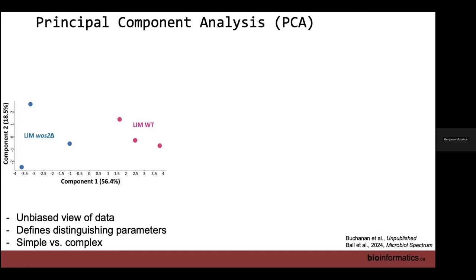Yeah. So as far as I know, PCA is a kind of linear dimensionality reduction, whereas there are a bunch of tools which do non-linear dimensionality reduction. Benjamin also mentioned t-SNE, UMAP, topological data analysis, etc. As far as I understand, during linear transformations, you may lose the information about the multidimensional relations between your objects. Is it that important in comparing the replicates?